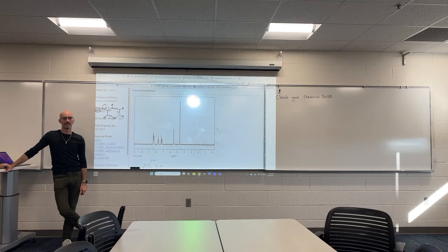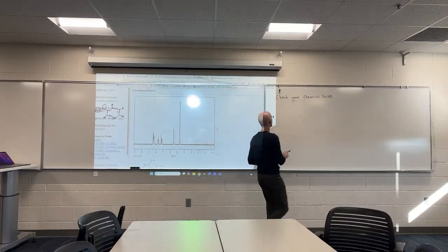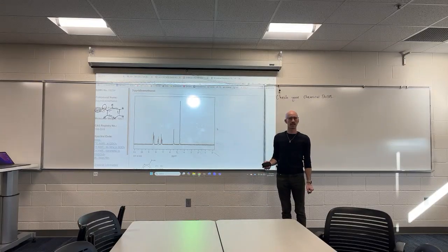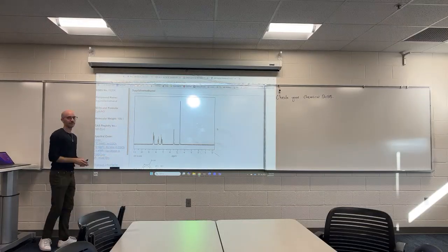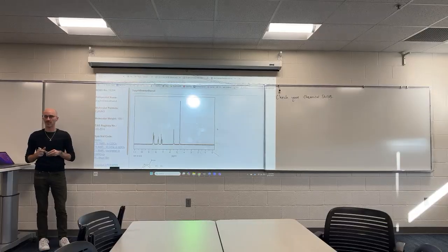Questions on this? What questions do you have on this? Anybody else want to look at their structure because they feel like it really aligns well or it really does not align well? Okay.